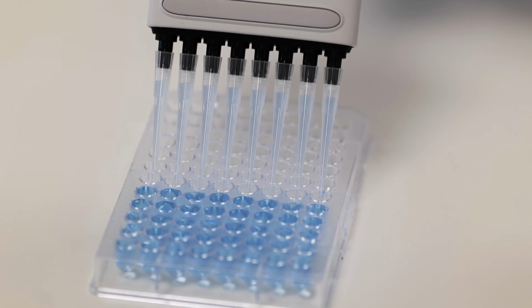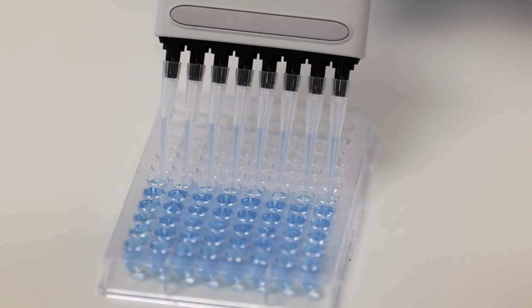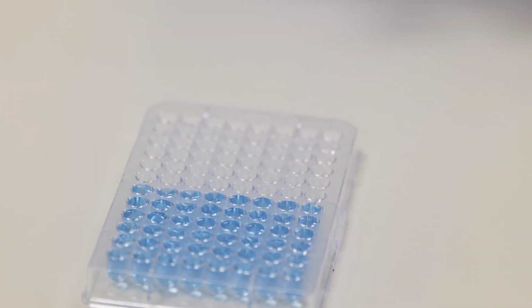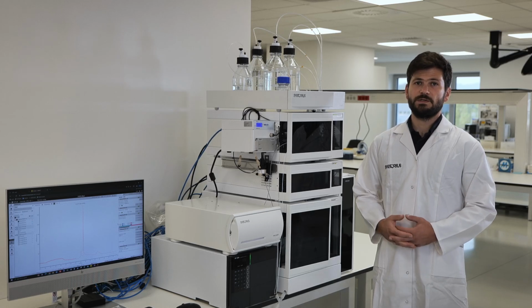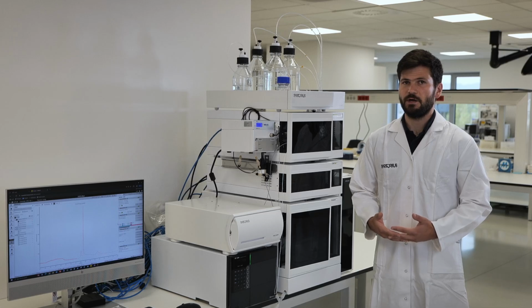One of the biggest challenges we faced was the ability to analyze all DSP samples, including crude samples, without having to extensively prepare them for analysis. Having the ability to analyze pre-capture samples has two key advantages that ease subsequent DSP steps. The downstream process is always optimized to a specific starting material with target AAV full capsid titer, volume, and both process and product-related impurity profiles.